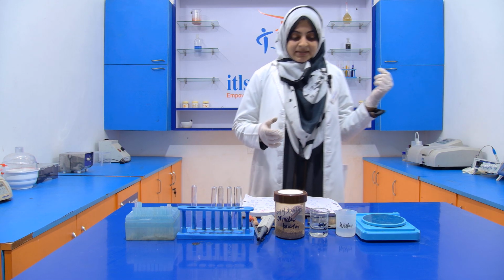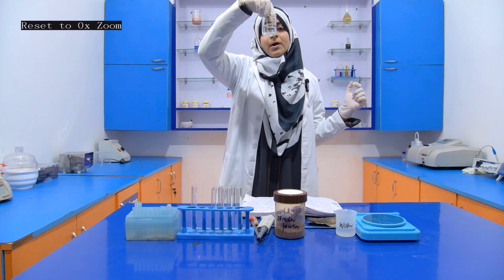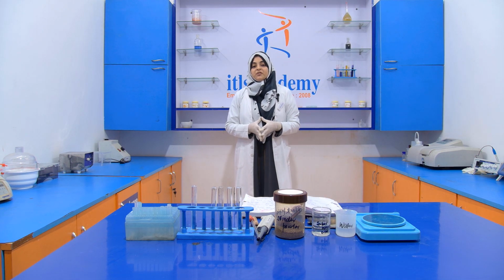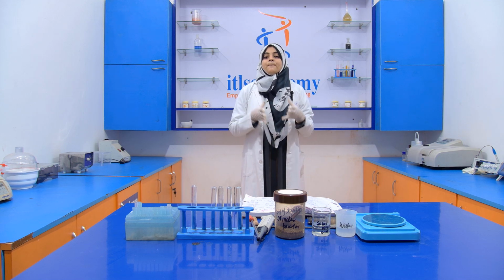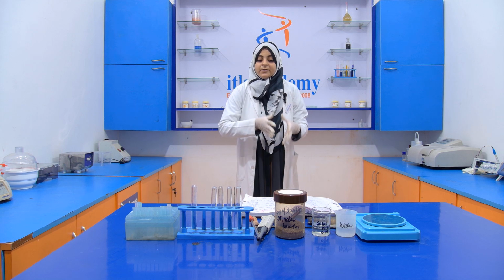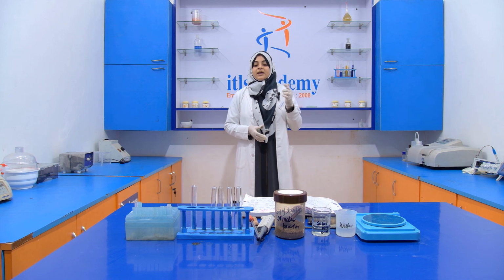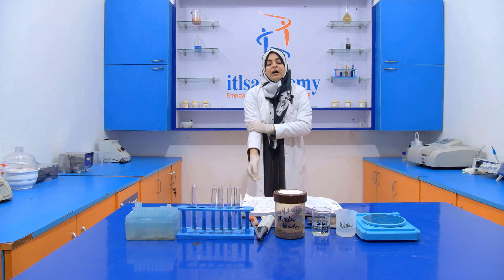Now for performing this experiment, we require only one chemical, that is silver nitrate 0.1 molar. For preparing this solution, we use a formula: weight is equal to molarity multiplied by molecular weight multiplied by volume taken divided by 1000. Then we put in the molecular weight of the silver nitrate, and then how much volume we have to prepare.